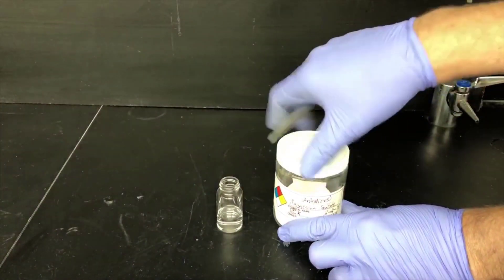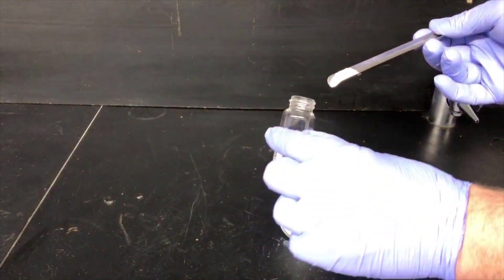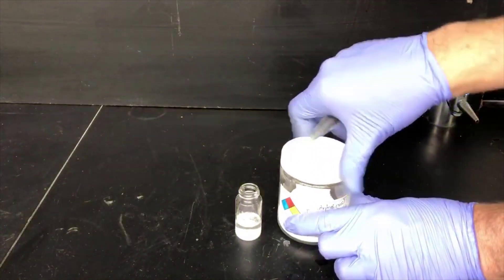Now we'll dry the organic layer using anhydrous magnesium sulfate. We're going to add enough to make a thin layer on the bottom, maybe 2 millimeters thick. Add about this much magnesium sulfate and swirl it around.